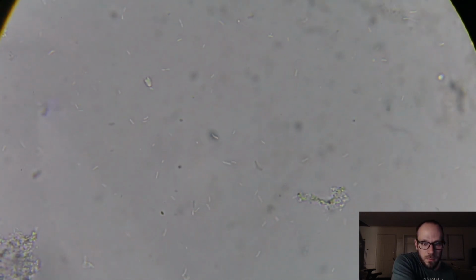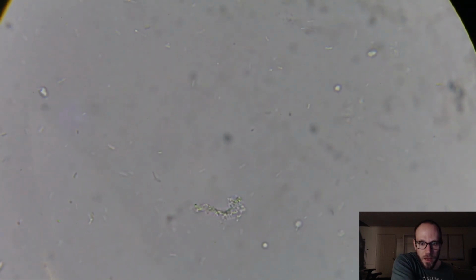Oh, that one's... oh, wait. I see a shadow of something. I think I lost it. Yeah, pretty sure these are all bacteria. But we can't use dark field at 400x. It's just not very good. I got the brightness all the way up. It looks like Brightfield, but the plane of focus is so thin that it just becomes useless, sadly. So what I tend to do is make it like an oblique illumination filter by pressing the filter out halfway, and that allows me some more contrast. But I typically only use 400x if I found something super interesting to look at.